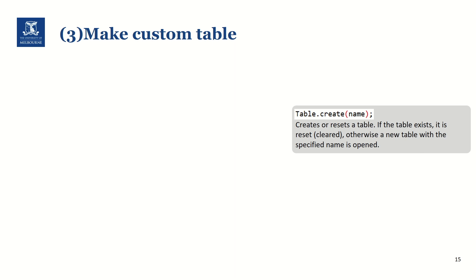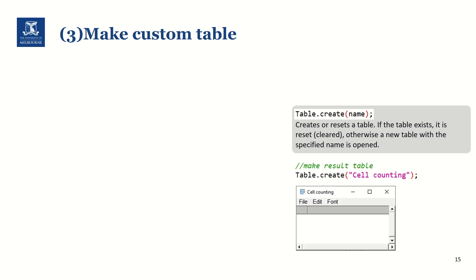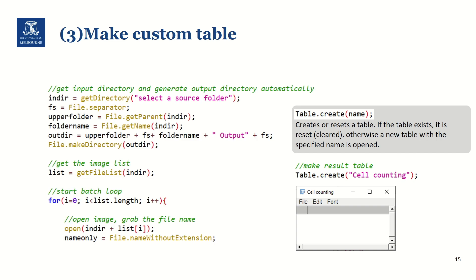The function to create a table is simply called table.create, and we can add the title of our table inside the bracket. This function will create or reset a table — if there is no table, it will open a new table with the specified name. But if a table with the same name already exists, it will reset the table, meaning all the contents will be cleared. So we need to use this carefully, placing it only once at the beginning of the script unless we want to reset the table in each iteration. I will name my table 'Cell counting', and this will generate an empty table with that title. We will set the column headings and details when we have the values to log later on. We can place this part before the for loop starts.